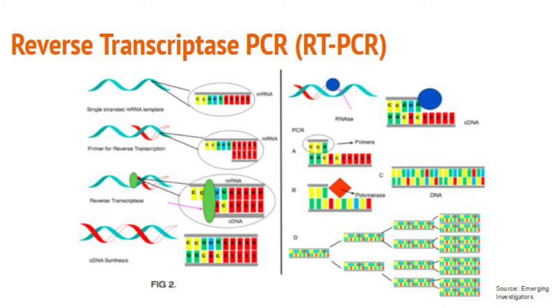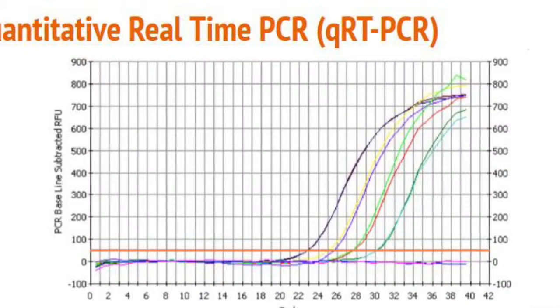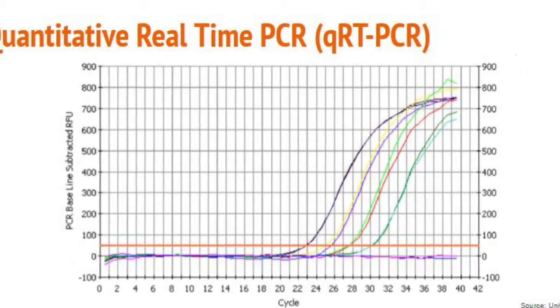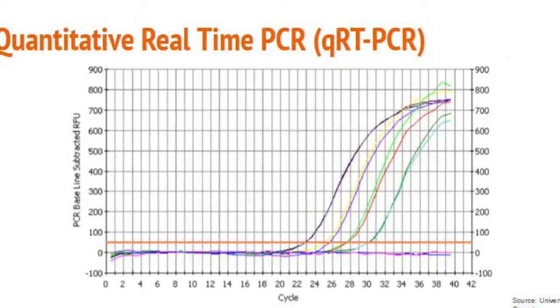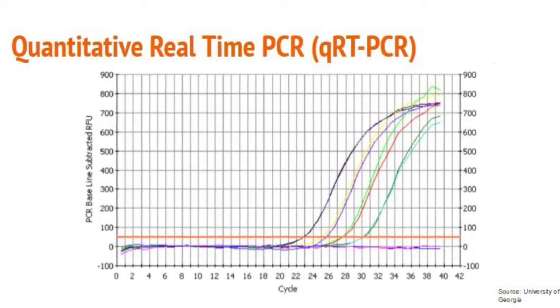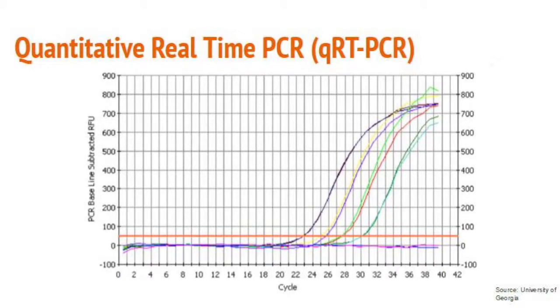Reverse transcriptase PCR is based on a mechanism used by retrovirus, producing DNA from RNA. This PCR needs one previous step using reverse transcriptase to synthesize complementary DNA that could be used as a template in a normal PCR reaction. Real-time PCR consists of constant collection of fluorescent product over a number of cycles and conversion of the fluorescent signals into a number which corresponds to the number of products obtained from the number of cycles.